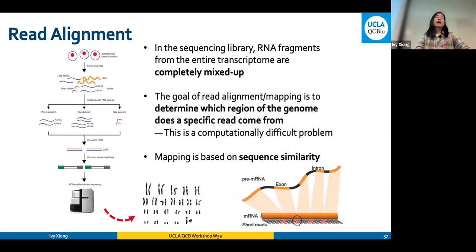And we're going to try it today with the KV1's SC sample. And even with the cluster, I waited. It takes about half an hour. But you will see, this is relative to the time that it takes to process this step. And then, of course, mappings are based on sequence similarities.